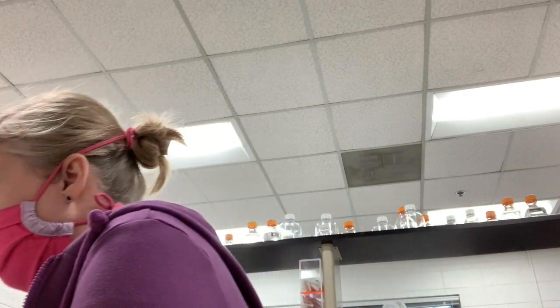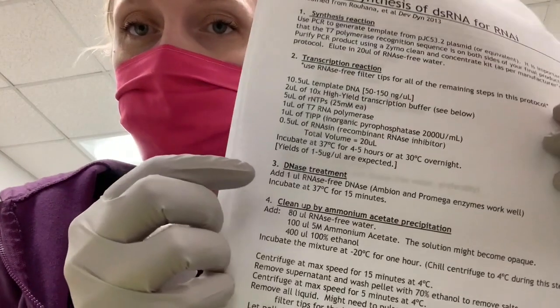Your high yield transcription buffer and rNTPs can go back into a freezer box. Any PCRs that you have left over can go into a freezer box, and any tubes that are empty, if you've used up your master mix or the DNA from your PCR, can just go in the trash. So we'll let this go overnight, and then we will resume the protocol with DNase treatment and cleanup. So I'll see you then.